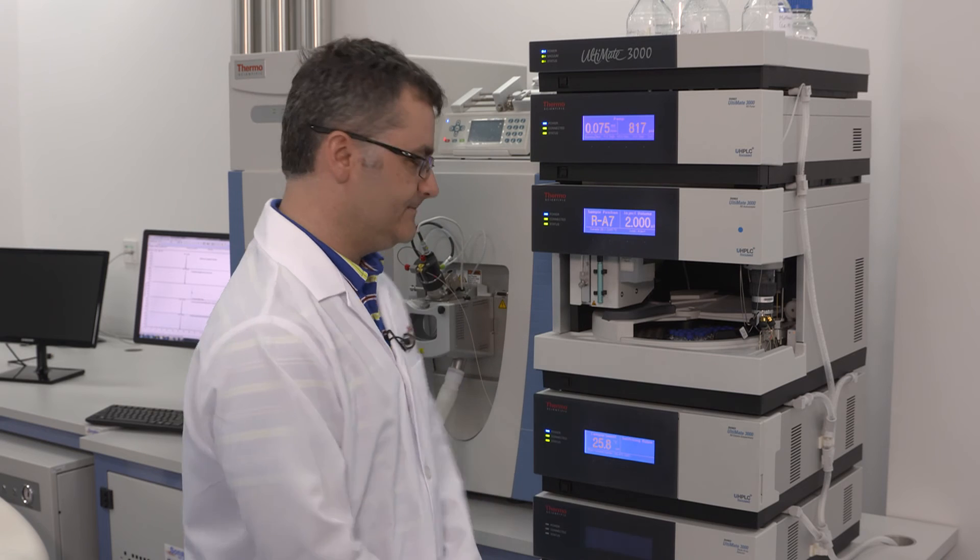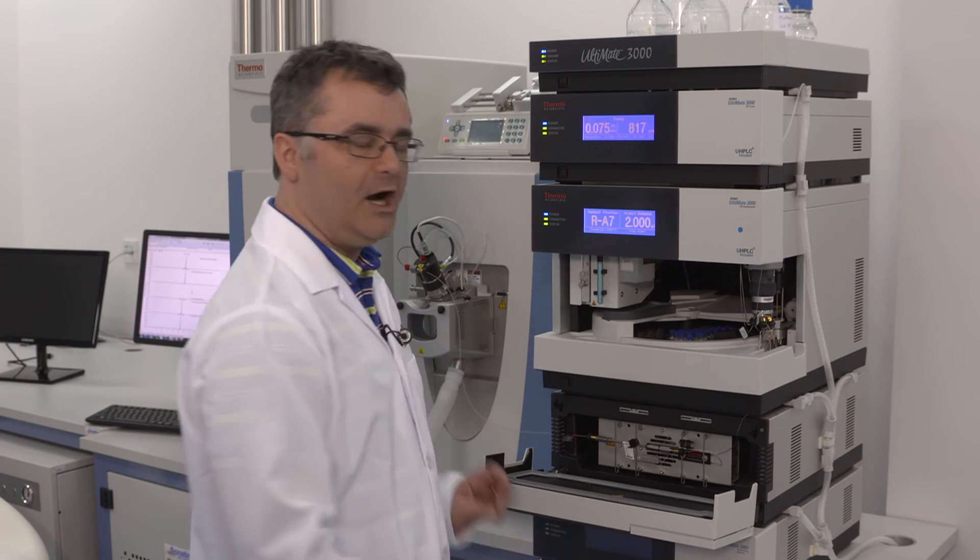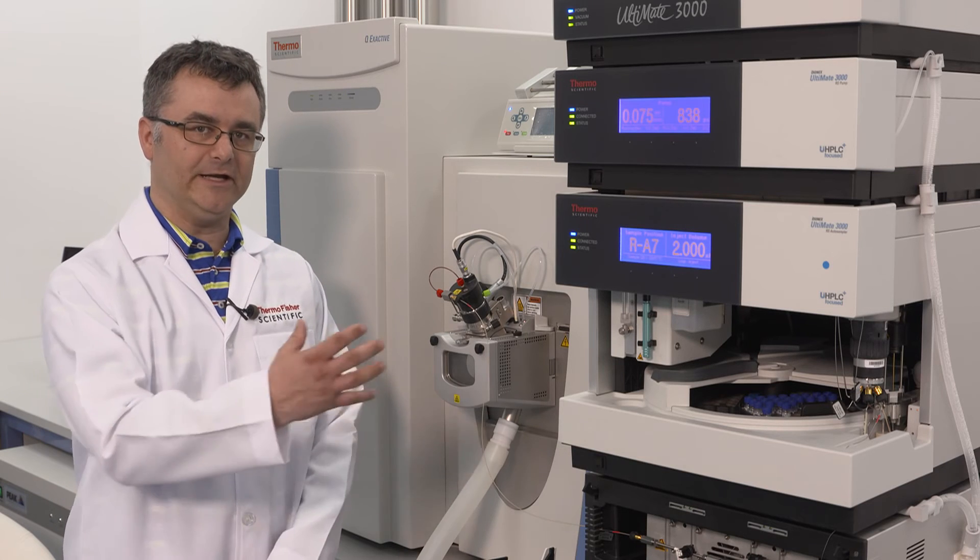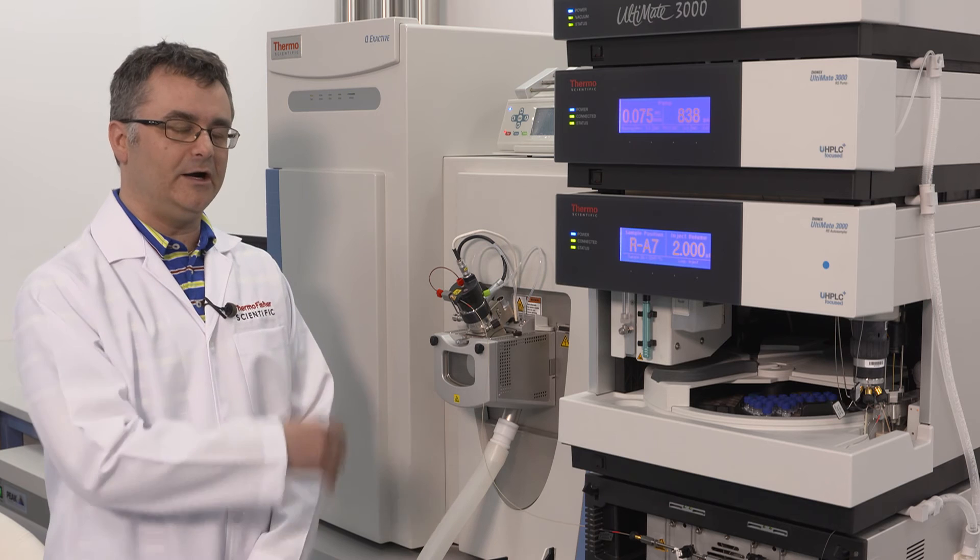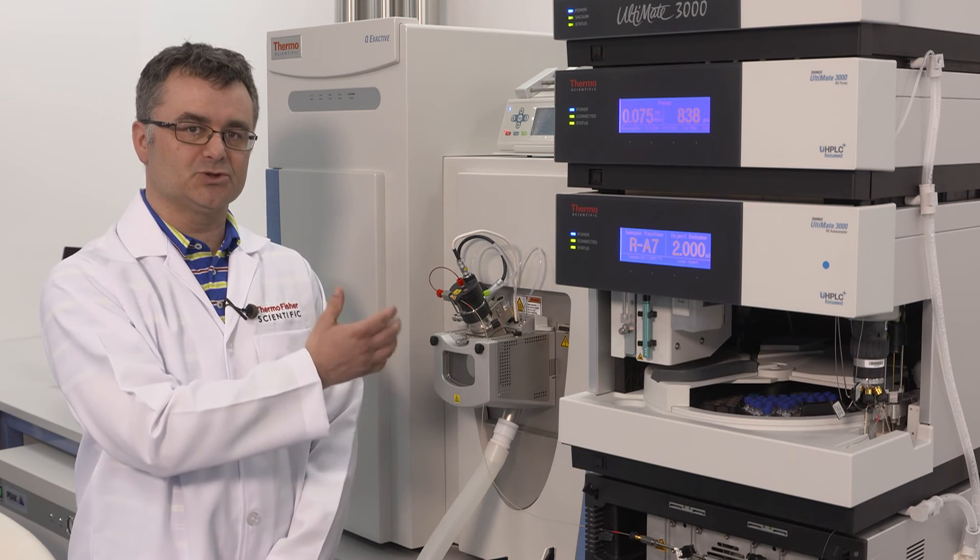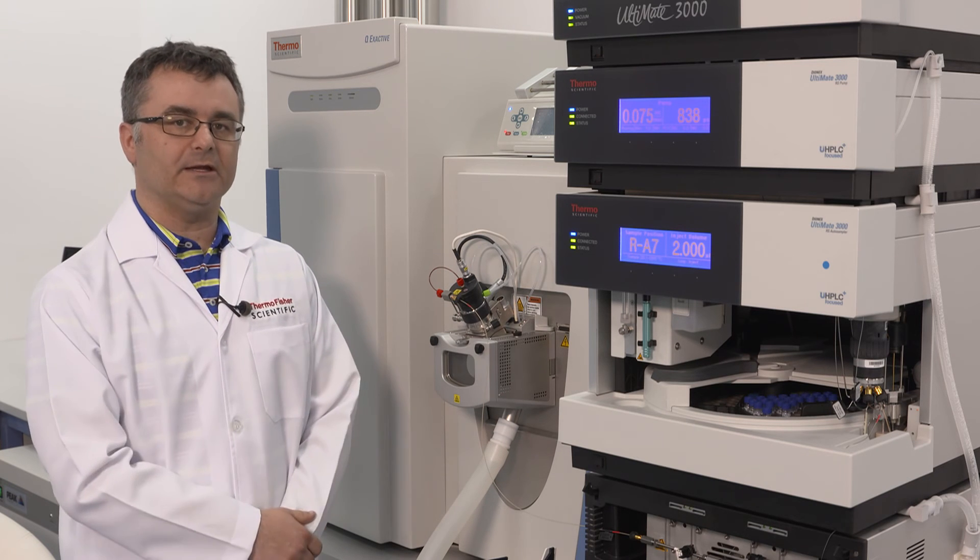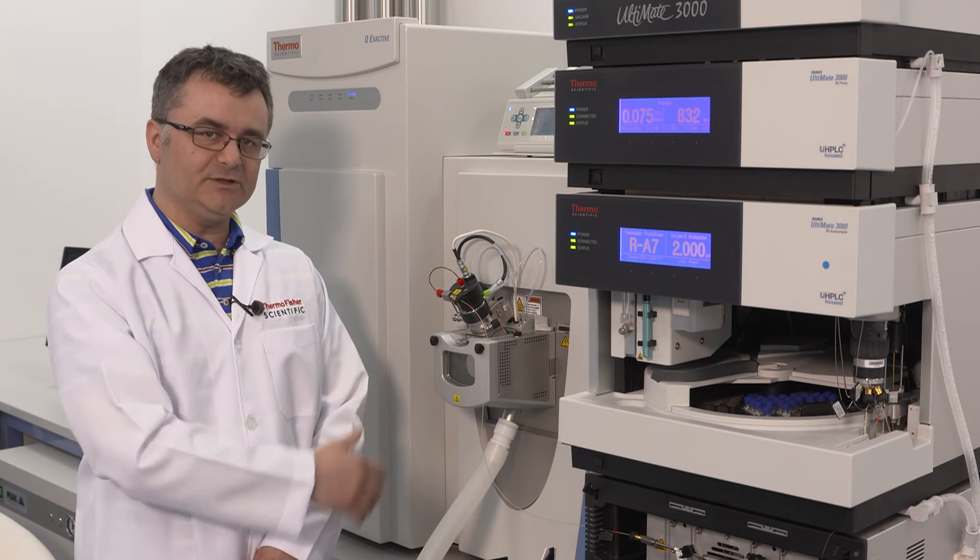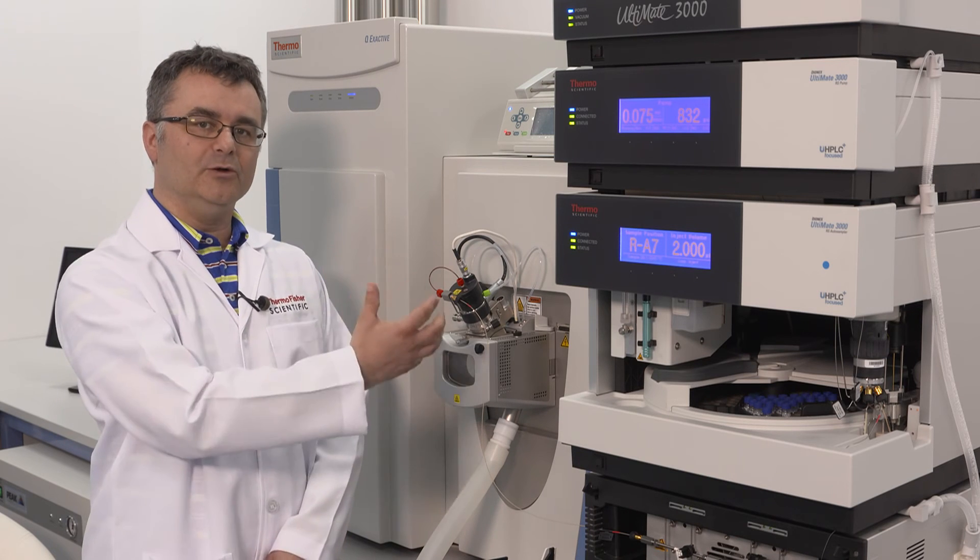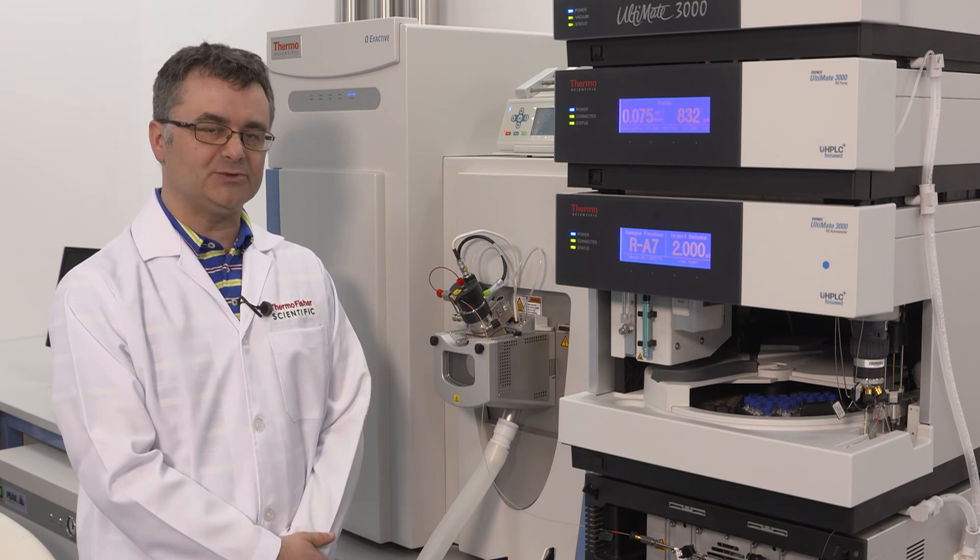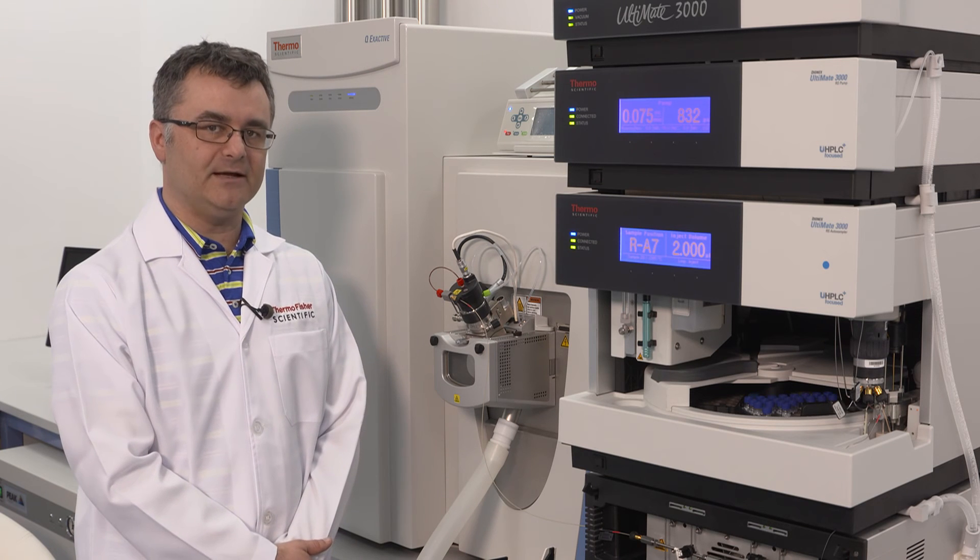Two microliters of the sample are injected. Peptides are separated onto a C8 biobasic column using a 30-minute gradient. Tryptic peptides that are eluting from the column are ionized using an electrospray source and then transported into the mass spectrometer. The precursor ion will be filtered with a quadrupole and then will be brought to the Orbitrap region for high resolution analysis.